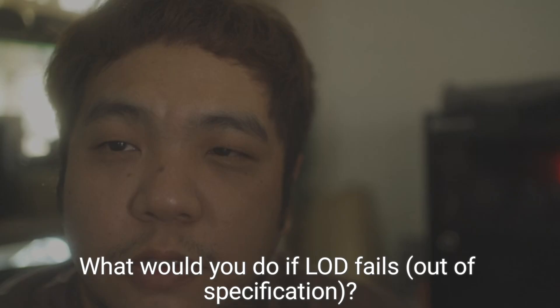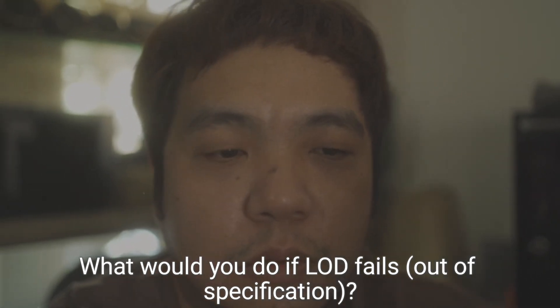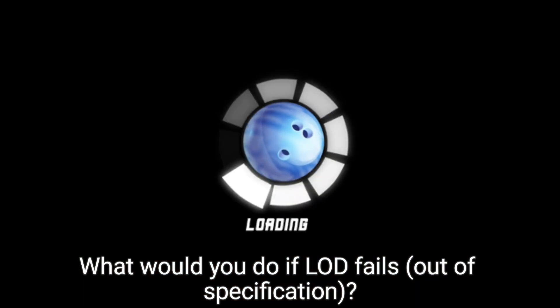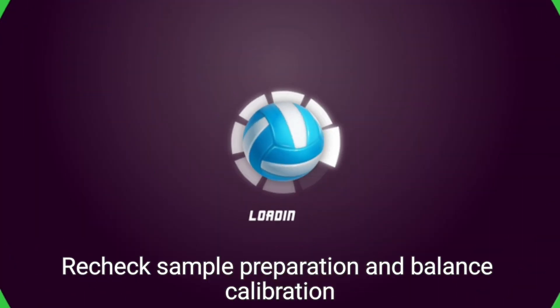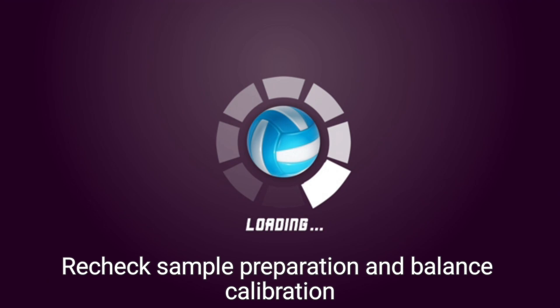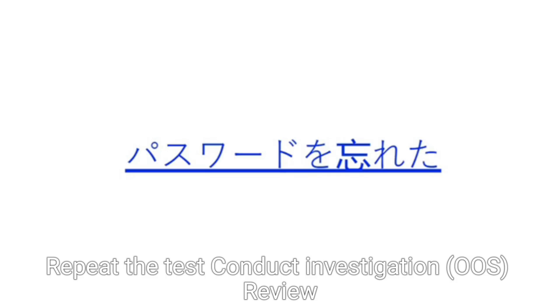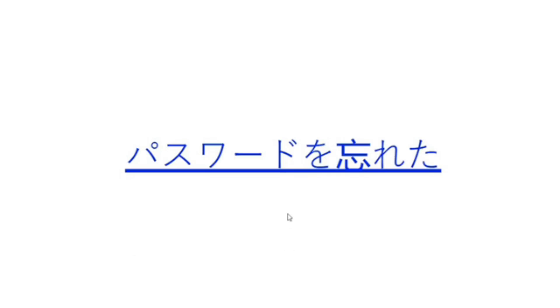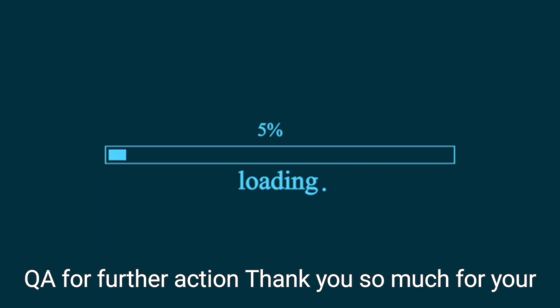Question 15: What would you do if LOD fails out of specification (OOS)? Recheck sample preparation and balance calibration, repeat the test, conduct an OOS investigation, review environmental and instrument conditions, and report to QA for further action.